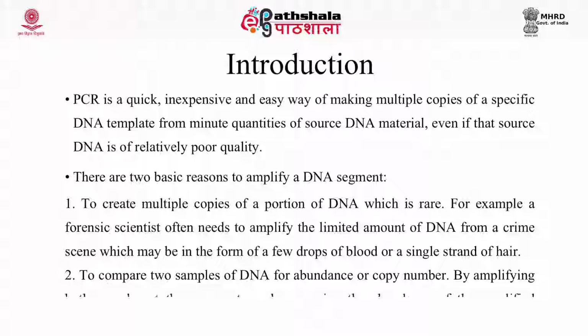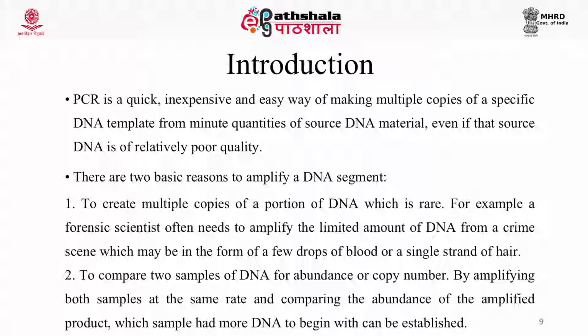The second reason is to compare 2 samples for abundance of DNA. Comparing two samples for abundance of DNA can help us understand which sample has more expression of this DNA.